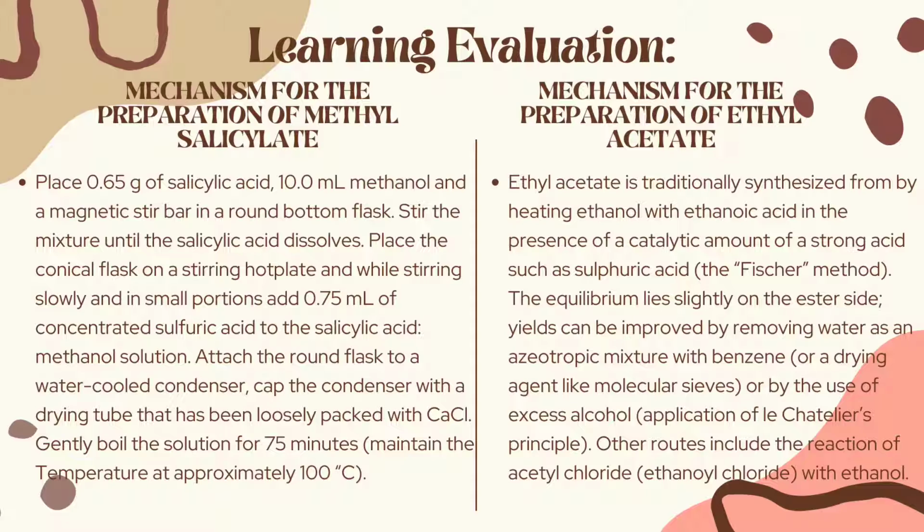While venting, allow the layers to separate and transfer the organic layer, which contains your product, to another container. Mix the solution together. Allow the solvent to separate and transfer the organic layer to a clean, dry flask. Dry the solution with anhydrous sodium sulfate.